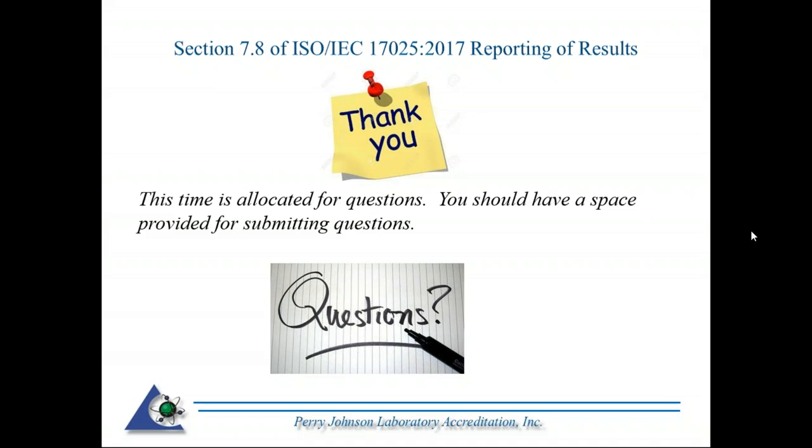Can you go over again situations where calibration factors are not necessary? I'm assuming you're talking about the correction factors there. So one thing you need to look at here is when you send equipment in for calibration, you should be specifying to the lab, and we're talking about statements of conformance, whether you require a statement of conformance.